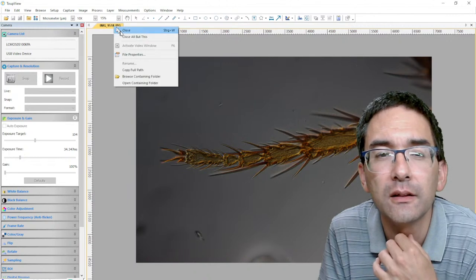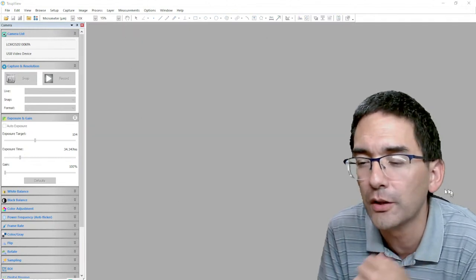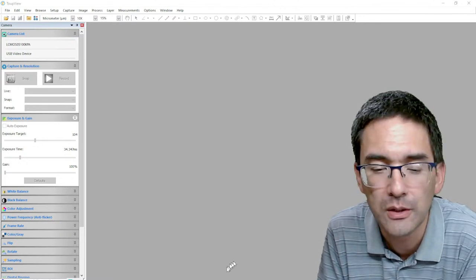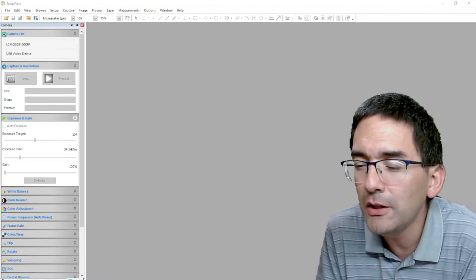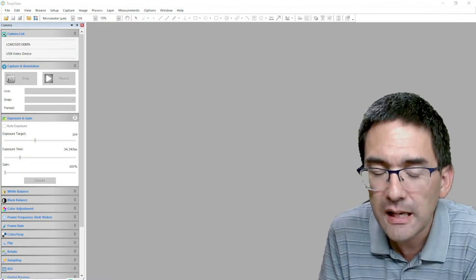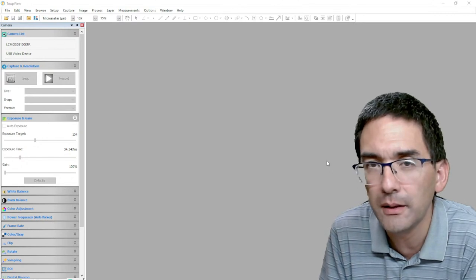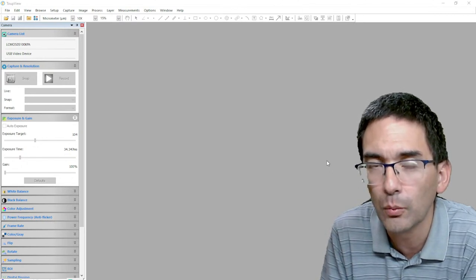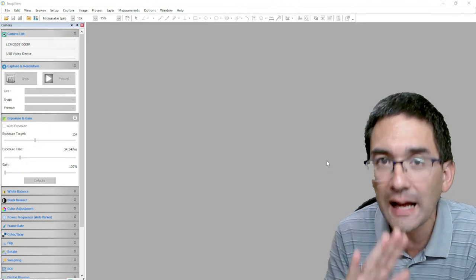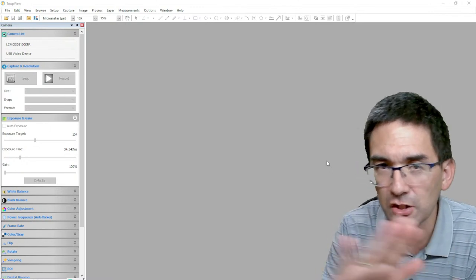So this is basically the other suggestion that I wanted to give you. Do the images all have to be taken in the same orientation? I mean, what if one image is rotated with respect to the others? In this case, they have to be all taken in the same way. For stacking, there can be a rotation. I'm going to show you later. But this has to be horizontally moved.